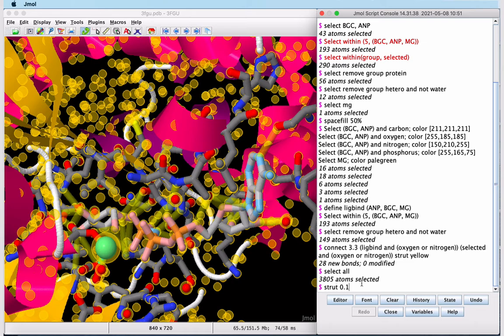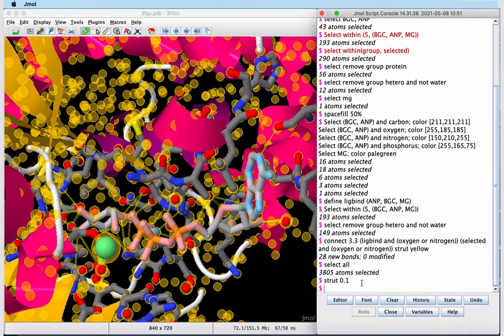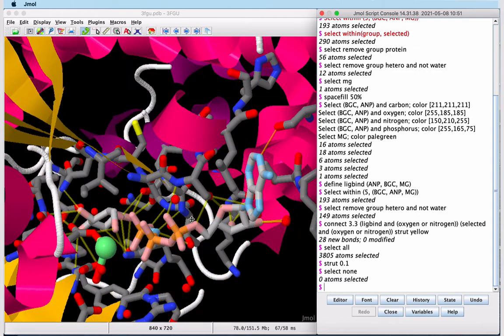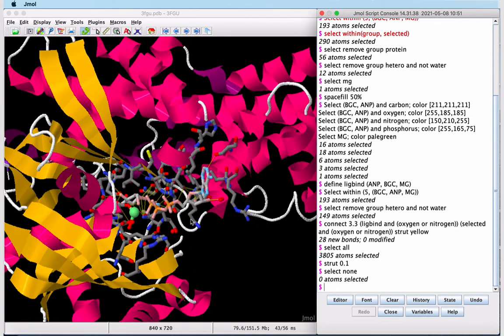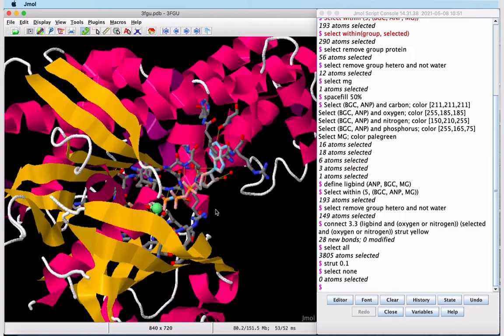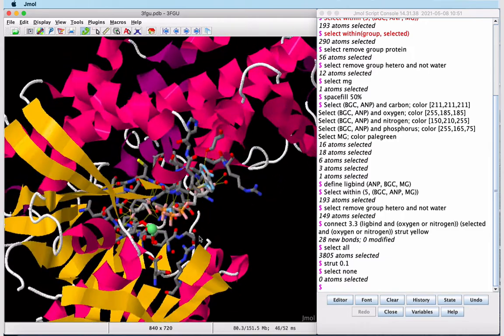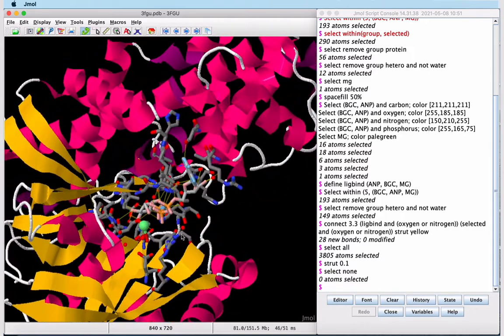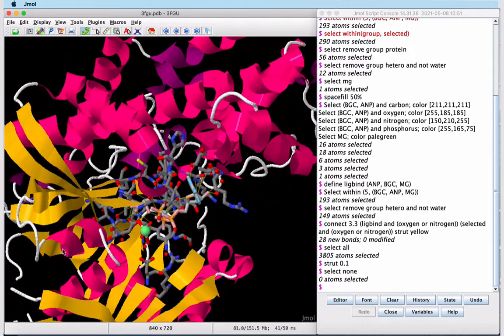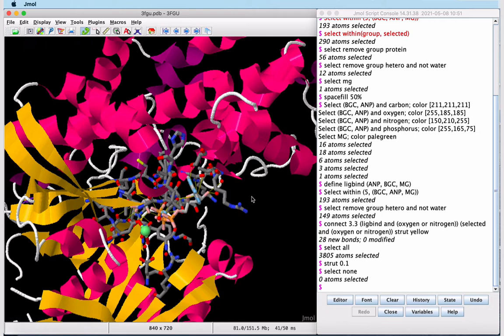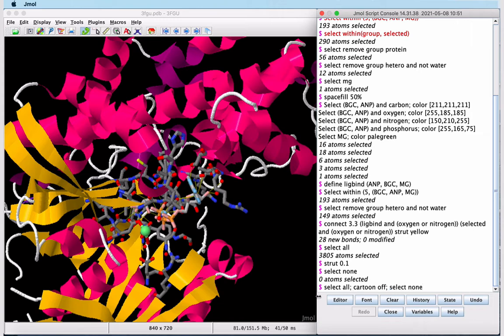The struts are quite thick, so we will resize them. Select everything, set the struts to be thinner, and clear the selection. Now it's great to see our active site within the context of the protein to see where it is. However, the protein cartoon can obscure things, so we're going to turn off the cartoon. And this time we'll do this with a line command. Note that multiple lines of JMol code can be separated with semicolons.